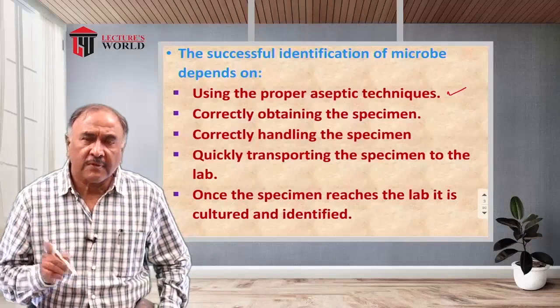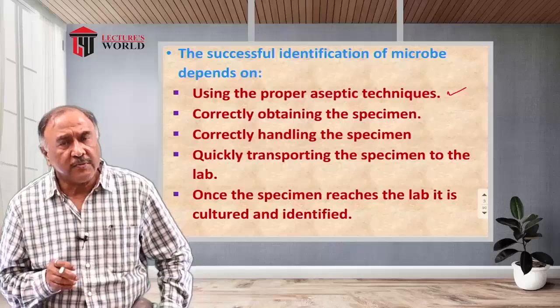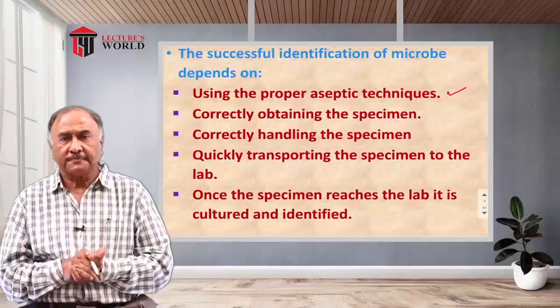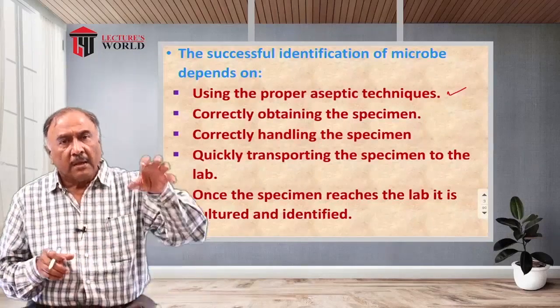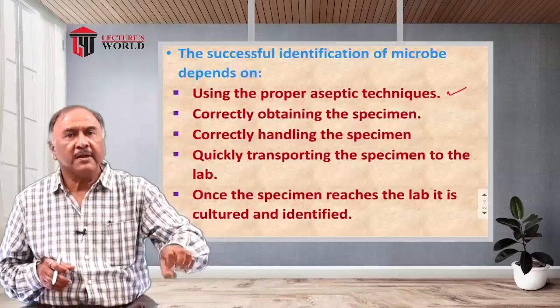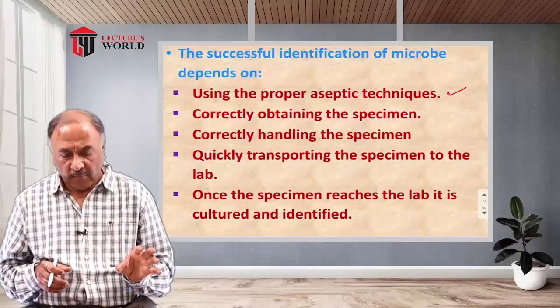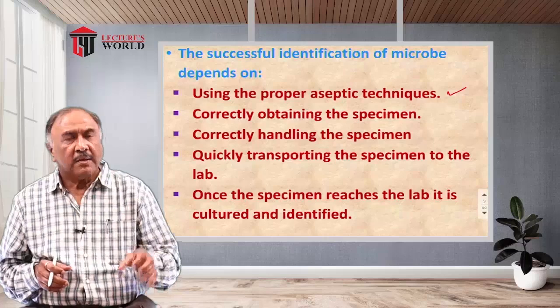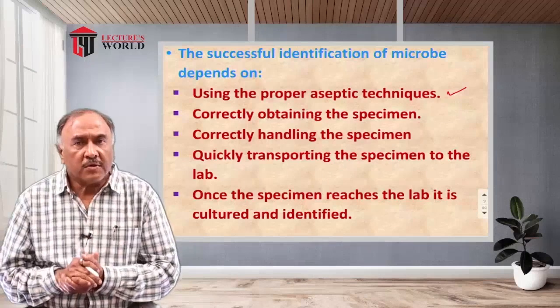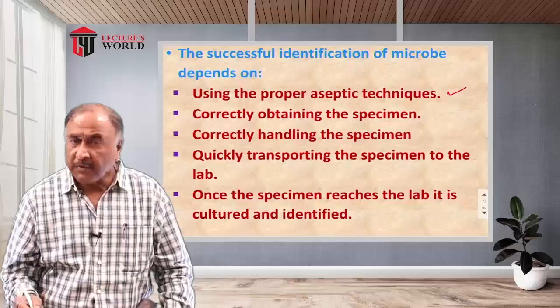So first is the aseptic technique, and it has to be used at each and every stage of these methods. It should be used where the sample is being collected from the patient and sent to the laboratory, as well as in the methods used in the laboratory, which should also follow aseptic procedures. So that was the first point.